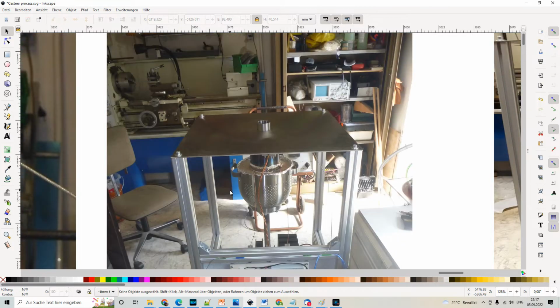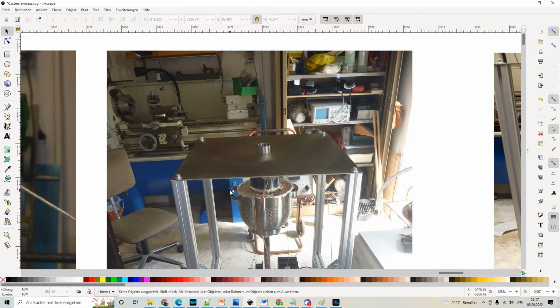And after watching this video, I hope that I give you enough information to make your own Castner cell. So what you can expect is to be able to create your own Castner cell with an output of about 100 to 150 grams of sodium per day.